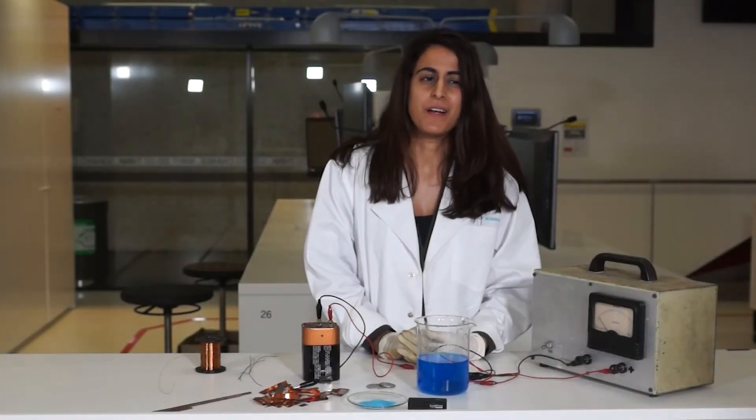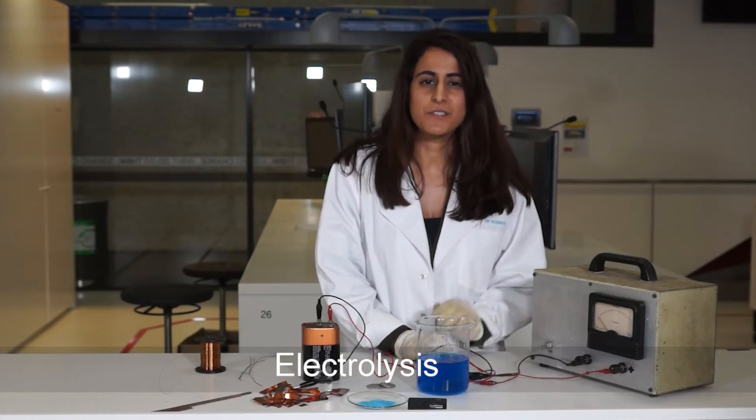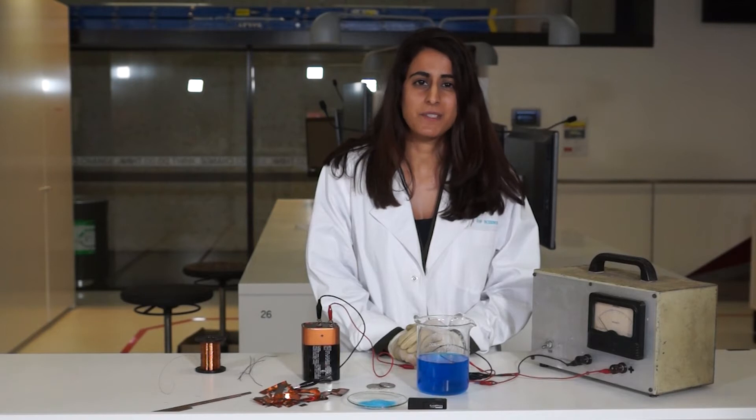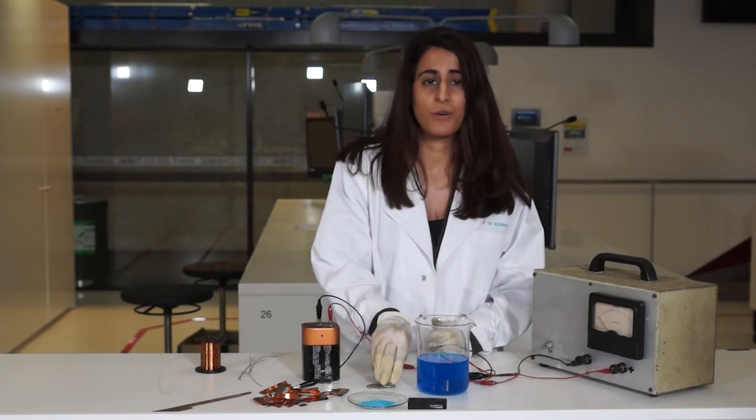Now how do we get purified copper? The most common method involves a process called electrolysis. Electrolysis describes a powerful reaction that's driven by electrical power. Now we're going to demonstrate the electrolysis by copper electroplating, or copper plating.